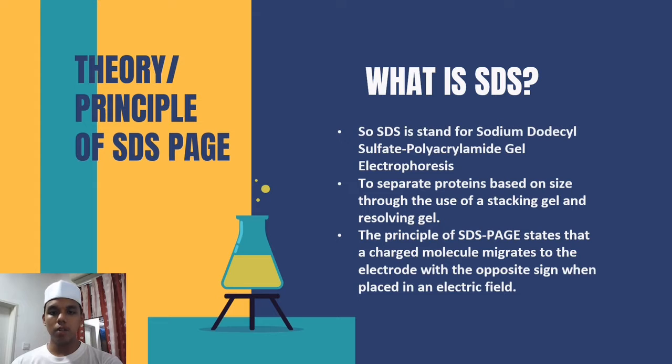The principle of SDS-PAGE states that a charged molecule migrates to the electrode with the opposite sign when placed in an electric field. The separation of the charged molecules depends upon the relative mobility of charged species. The smaller molecules migrate faster due to less resistance during electrophoresis.